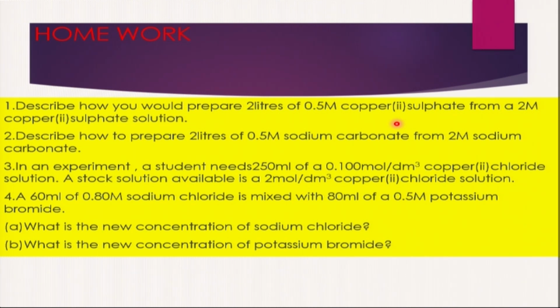After filling it, make sure you are very accurate, because when you are measuring these solutions, accuracy is a must. Therefore, the solution that you have prepared will contain 0.5 molar copper 2 sulfate. So that is what you are supposed to do, even with other questions.